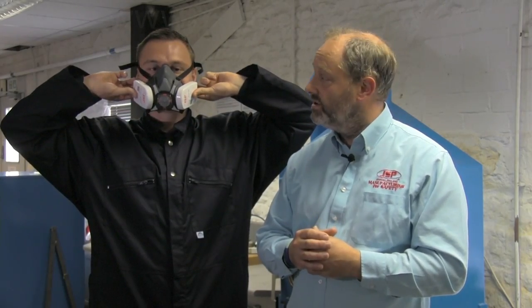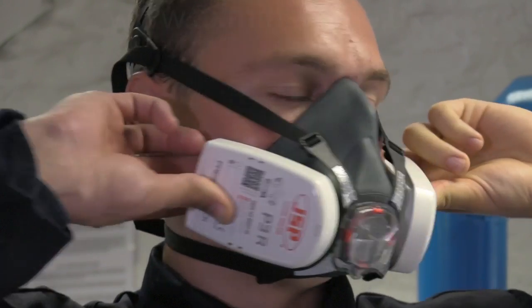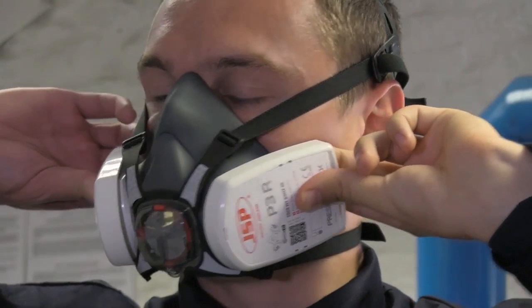And then look to the left and again to the right. Now we can see Joe's got a perfect fit and he's ready to go off and do his day's work and be fully protected.